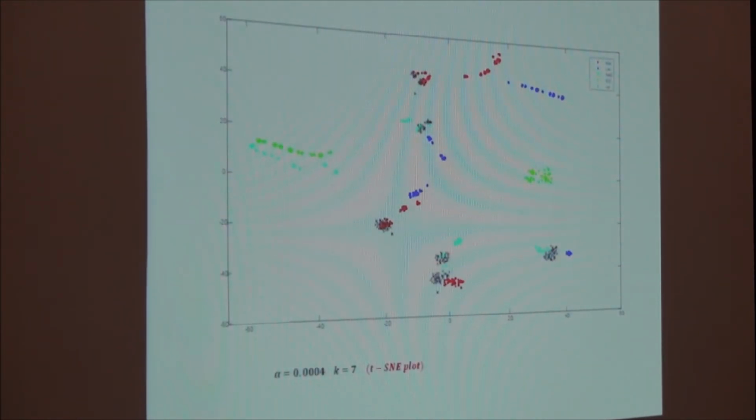So this is a t-SNE plot that represents your original data set in a 2-dimensional subspace. So this is not PCA, but it looks very much like PCA. So you can see how clearly each subset of data is clustered. And those black crosses are the unknown samples.